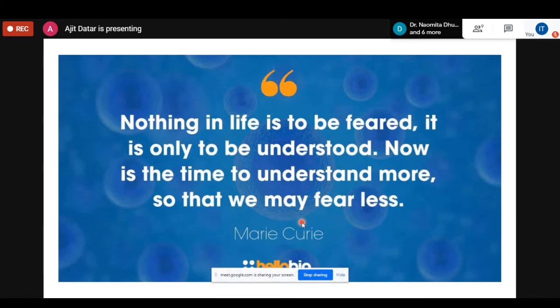Mr. Siddharth Sagar asks: I have performed Orbitrap LCMS-MS for brain tissue lysate proteins, and post that he has done HR LCMS-MS for band protein separated on native gel. How should he correlate these two techniques?